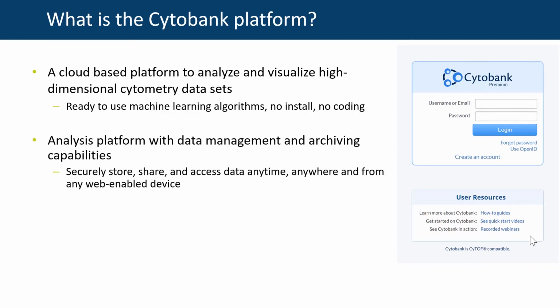And then since it is a cloud, we also have analysis and data management and data archiving capabilities within the cloud. So once we have everything uploaded into the cloud, we can go in there and we can manage how our data is displayed. We can organize all of our different experiments, and we have the ability to archive all of that data to keep track of our data over time.